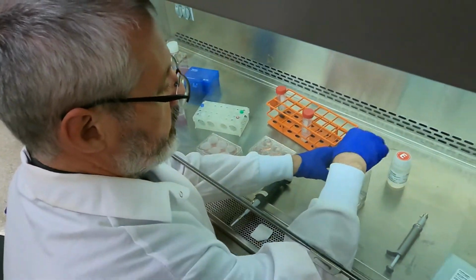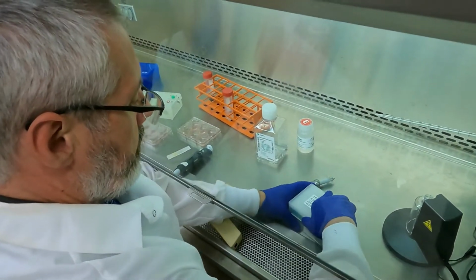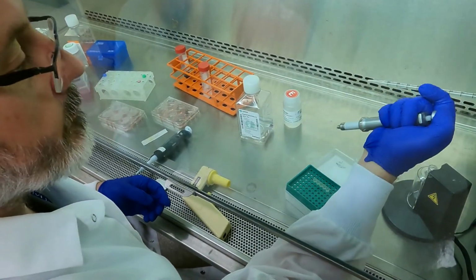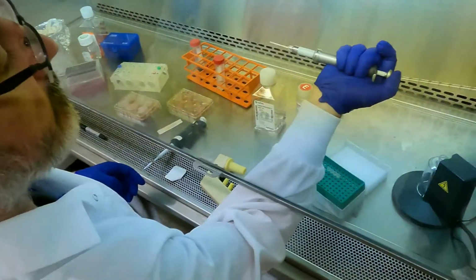Now, what we need to do is we've got these Neon tips that come with the Neon kit. So we open them up. We've got 4 tips. You need a special pipette here. Put it down like this. Grab. Right? You see that?